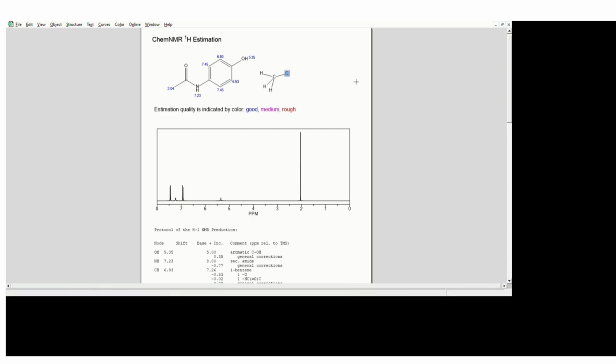Now we come to the neighbors also. Generally, I say we are not concerned about the neighbors, but here we should be concerned. How many protons are present in the neighbor is helpful to calculate the coupling pattern of the current nuclei. Here, there is no neighboring proton. It means the multiplicity is n plus 1. Here, n is 0.